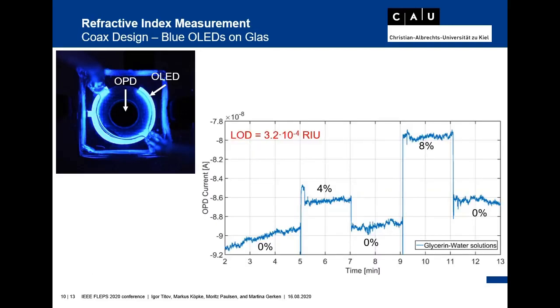Here we use again the coaxial shaped OLED-OPD design fabricated on a glass substrate. The experiments were carried out in the same way as before and also show really promising results for refractive index sensing with fluids. We injected 4 and 8% glycerin water solutions by weight with normal water samples in between. The switching behavior of the refractive index change can clearly be observed. Afterwards, we calculated the limit of detection to be 3.2 times 10 to the power of -4, and the OLED-OPD shows a very comparable behavior to the green emitting devices.